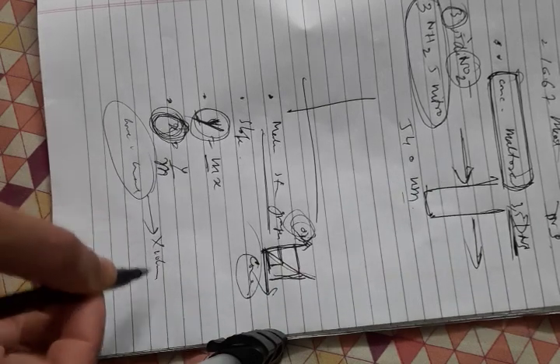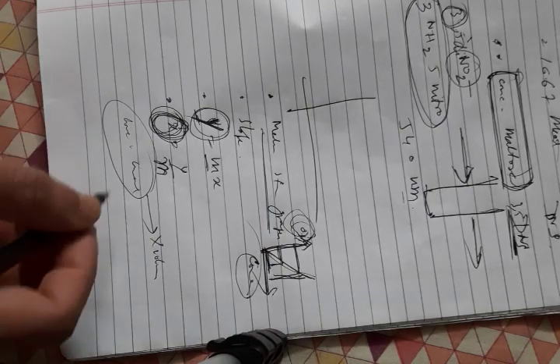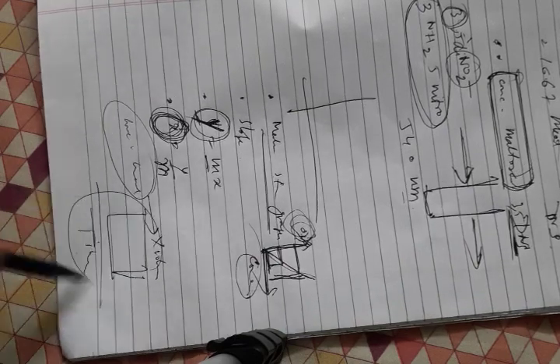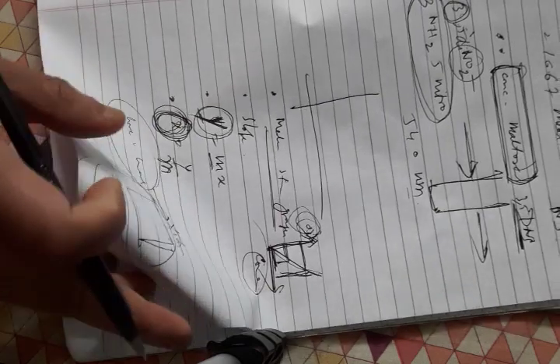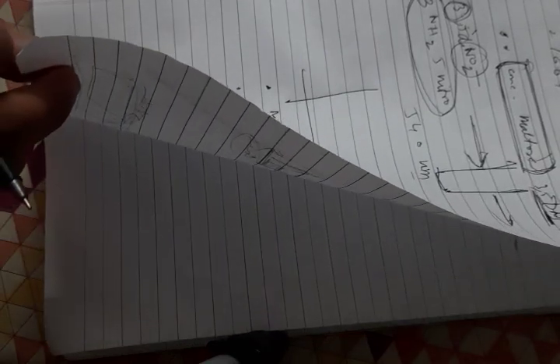If we know how much maltose is produced, then by dividing it by the time, we can calculate the activity, right? So that's it. Next we need to do it in quite some detail.